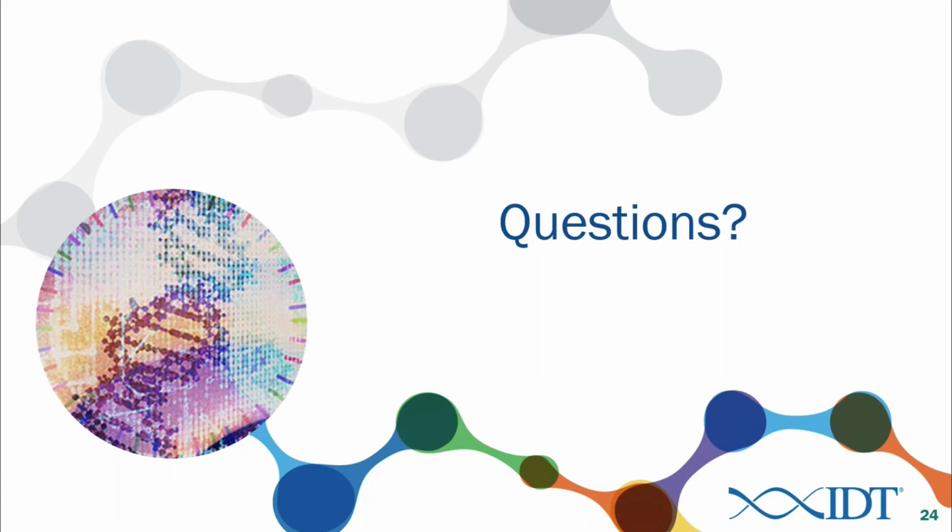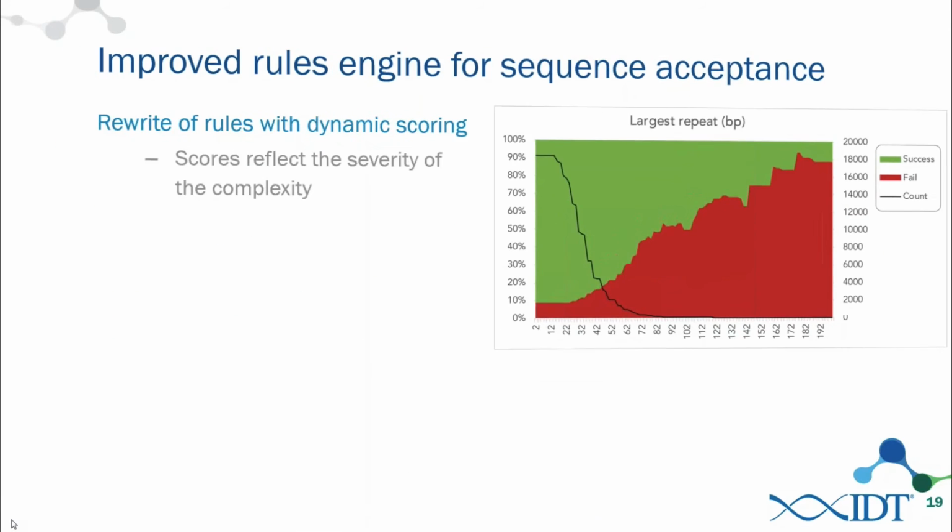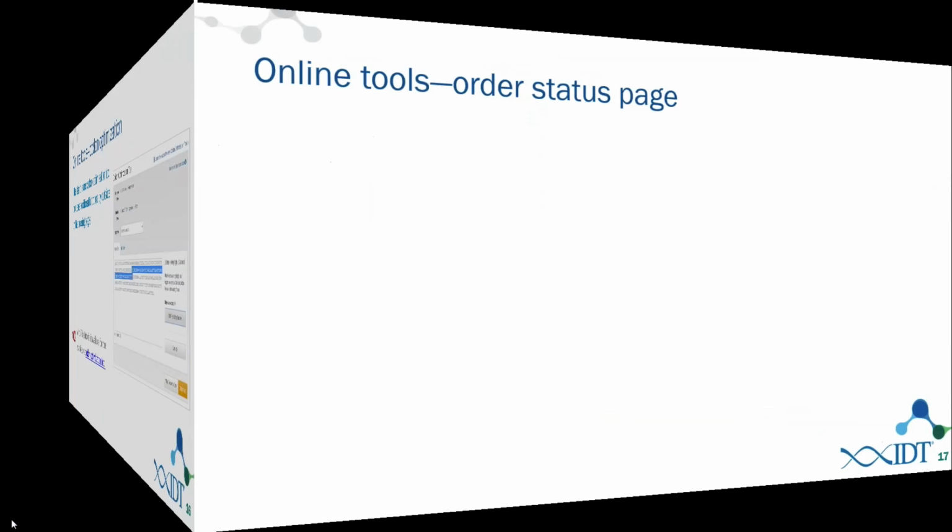So you touched on this already, but this person asked, what would you use the single-stranded DNA fragments for? So single-stranded DNA fragments and double-stranded DNA fragments can both be used for homology-mediated repair. And we can jump back to the slide on homology-mediated repair.